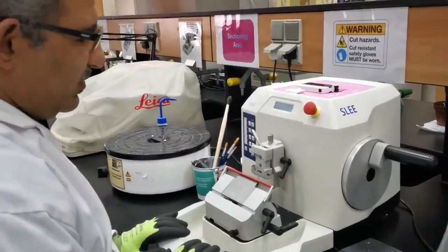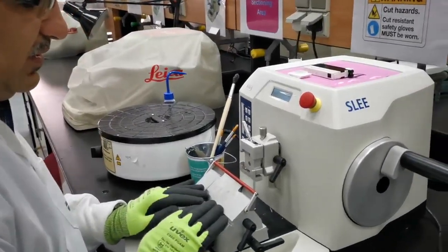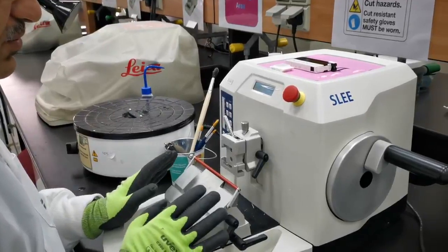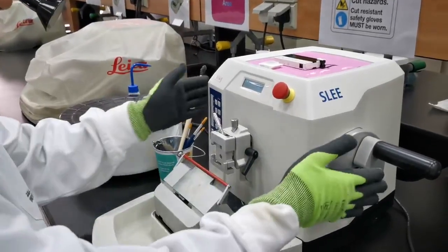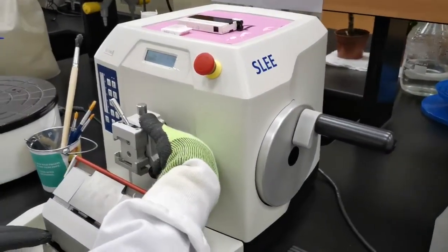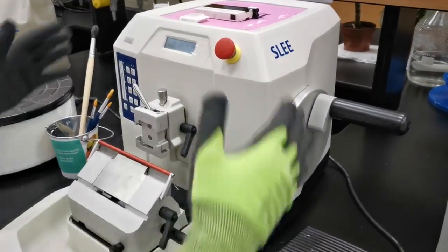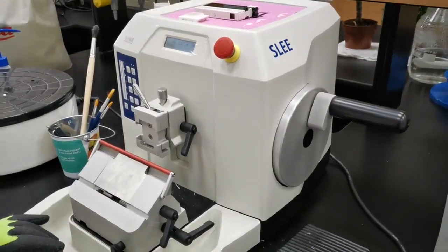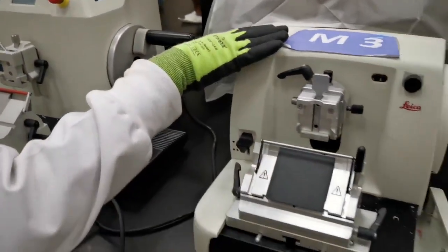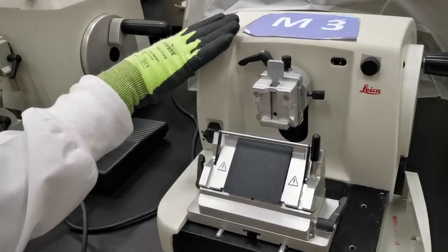I'm going to show you briefly how to use the automated microtome. As you remember, the rotary microtome is composed of a wheel that moves the block holder, and there is the knife holder here. These are the usual rotary microtome components that you already worked on and know how to use.